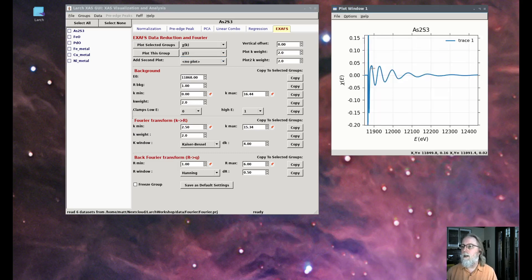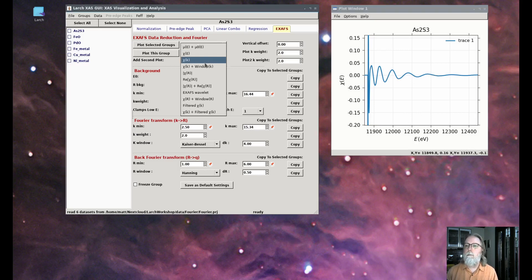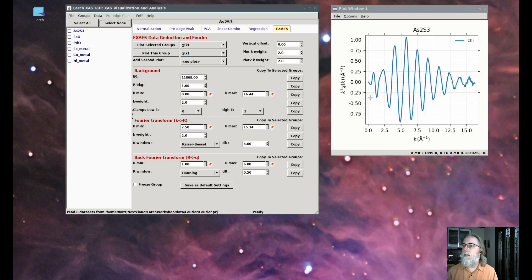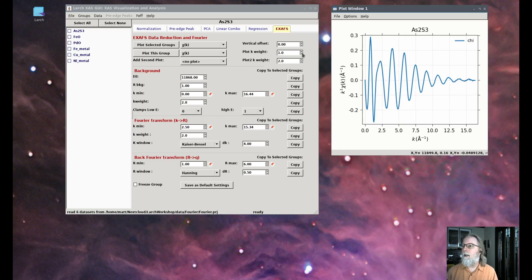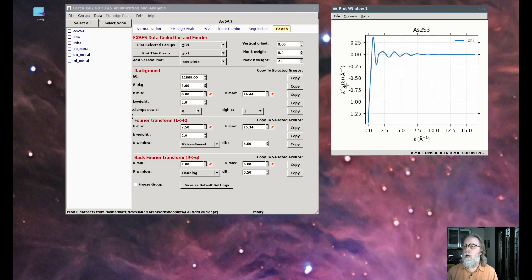Here it's a function of energy, and you can see that it doesn't oscillate with a single frequency in energy. But if we transform that to wave number chi of k, then it looks like it does oscillate with a single frequency in k. I've also weighted the data, as is commonly done in the literature and for analysis, by some power of k — so I've multiplied by k squared. If I change this to k1 weighting or k0 weighting, that's just chi of k, which shows why we often use k-weighting.